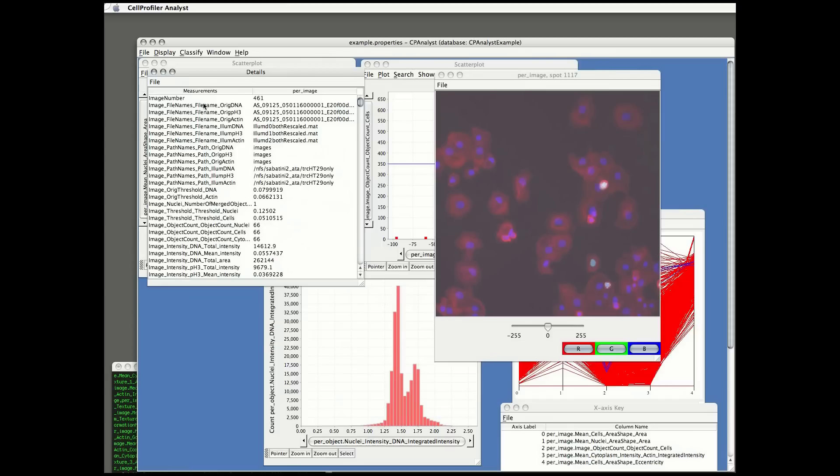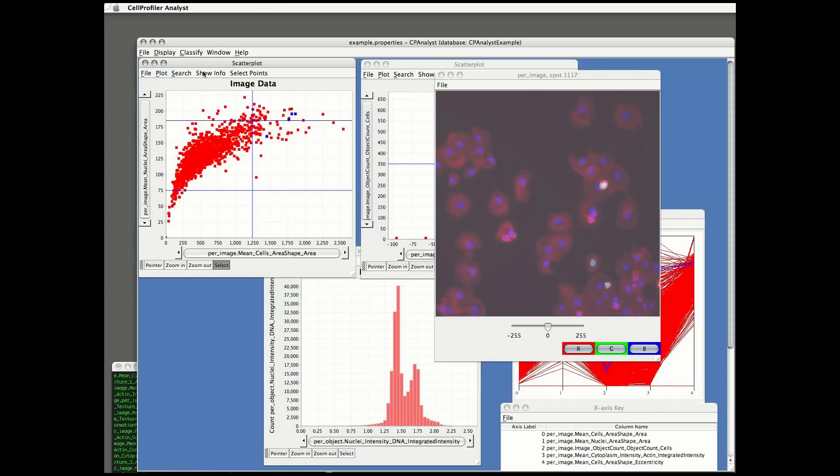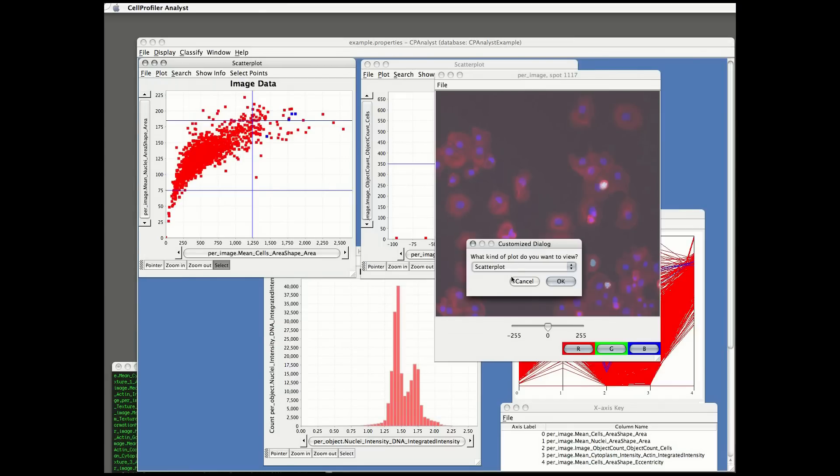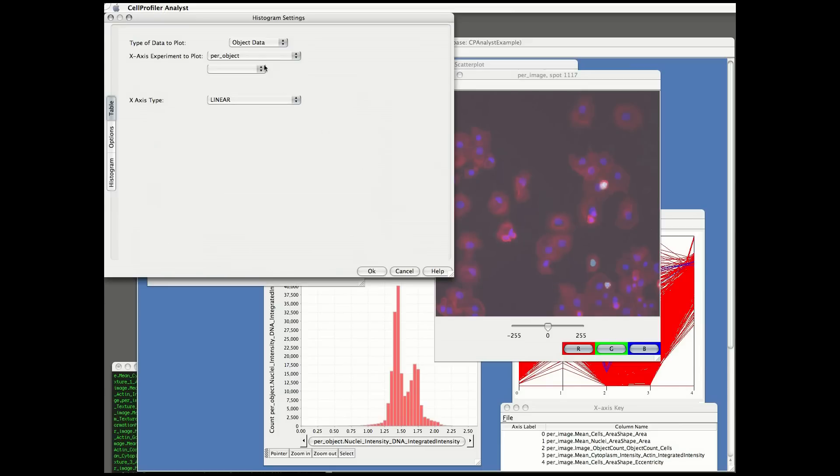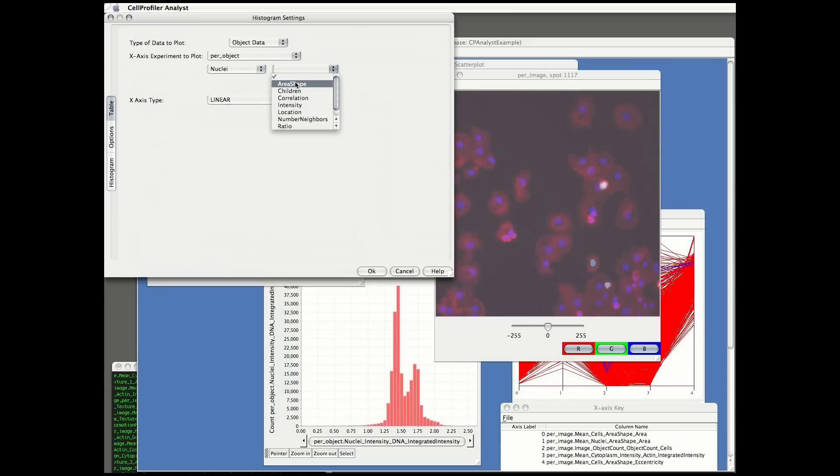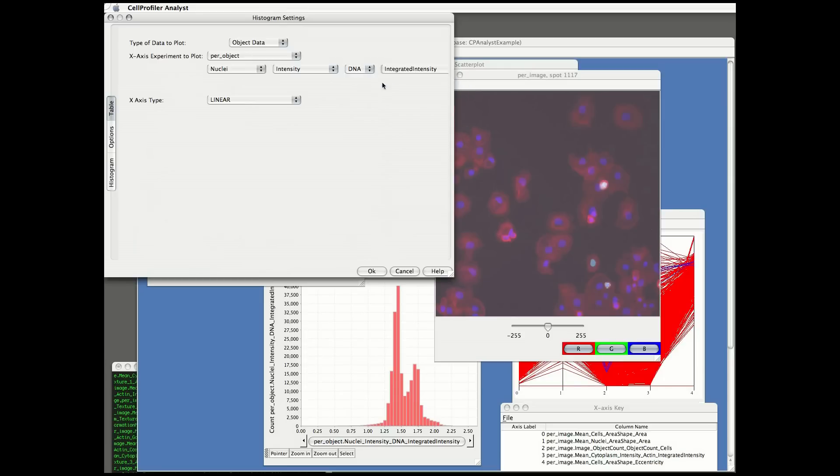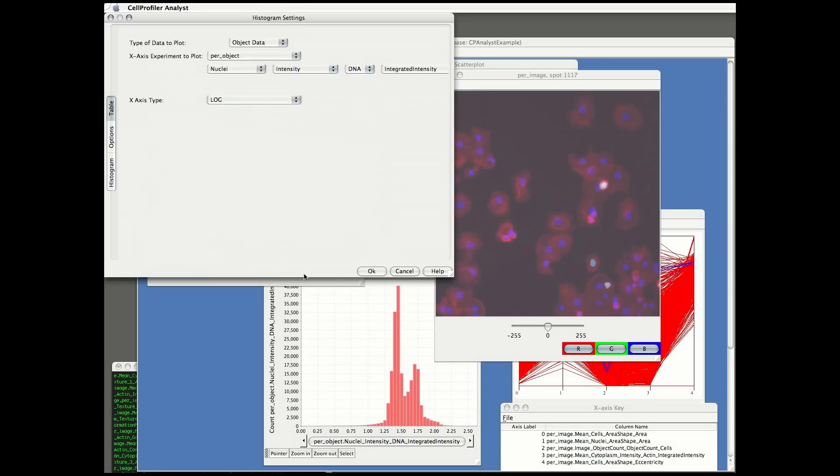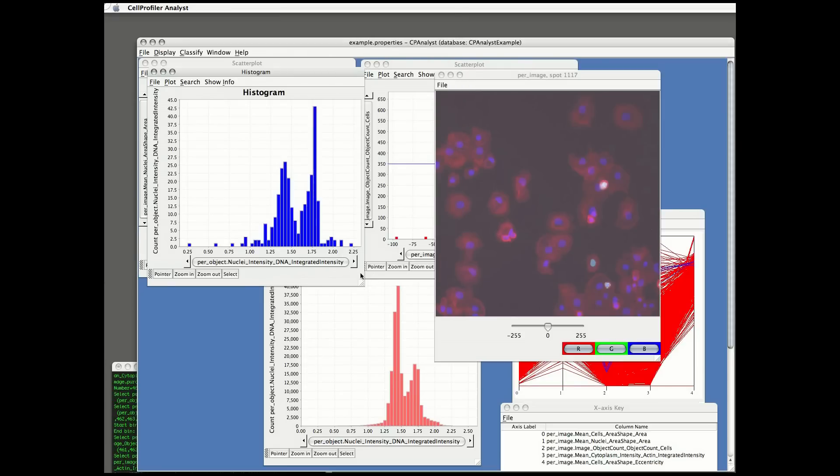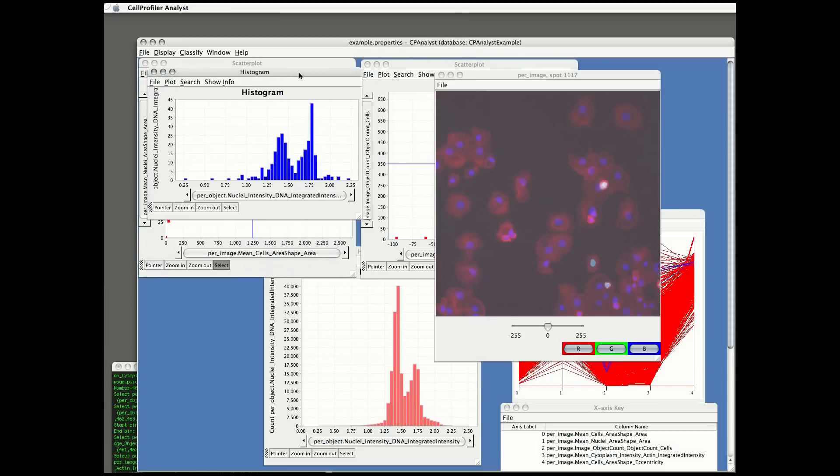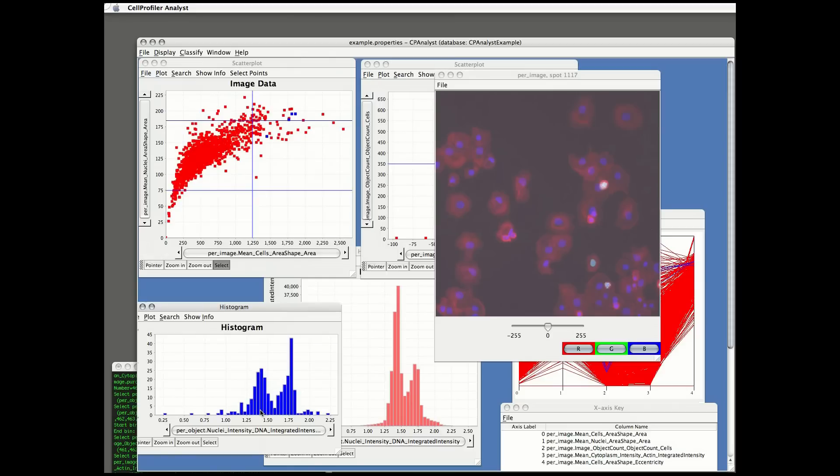And lastly, I can make a subplot of object data for an individual image or set of images. Here, for example, I want to see a histogram of the DNA content for just those four highlighted samples. So I'm going to plot it on a separate plot. You'll note that this cell cycle histogram is not visible in the large histogram simply because I've only got four images. There aren't very many cells. If I zoomed in on that plot, I would actually see the same data.